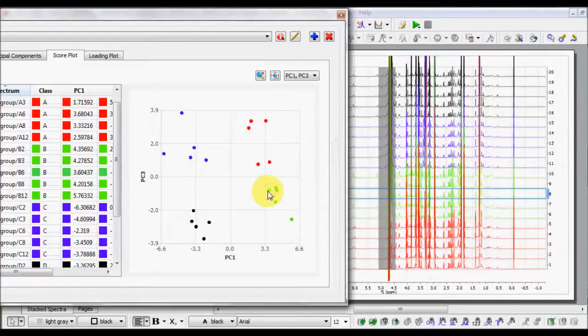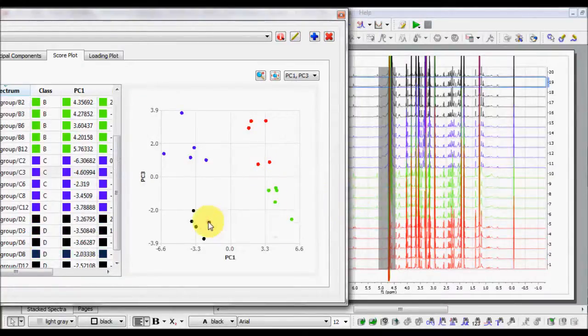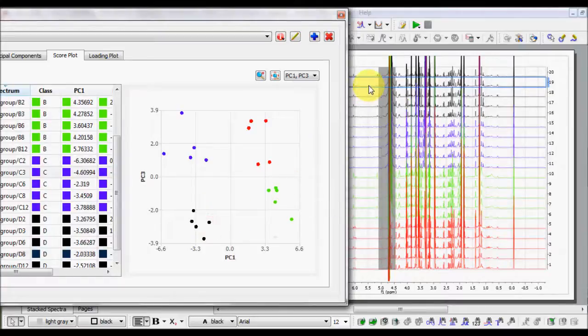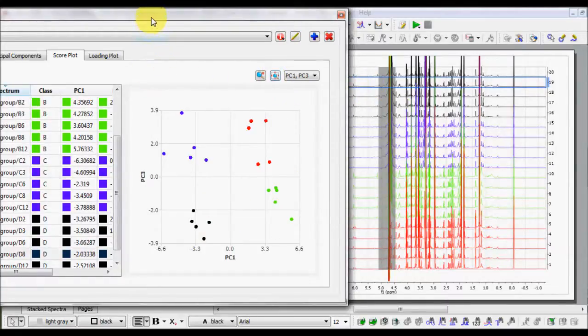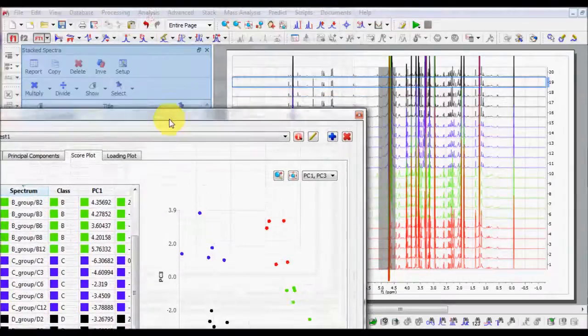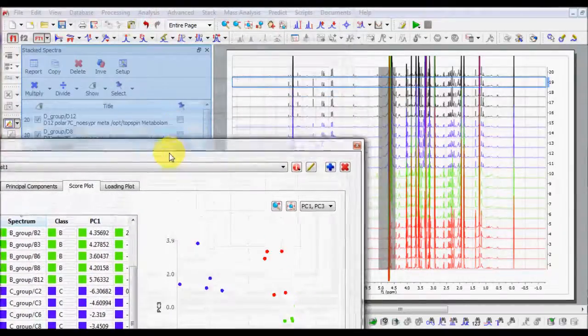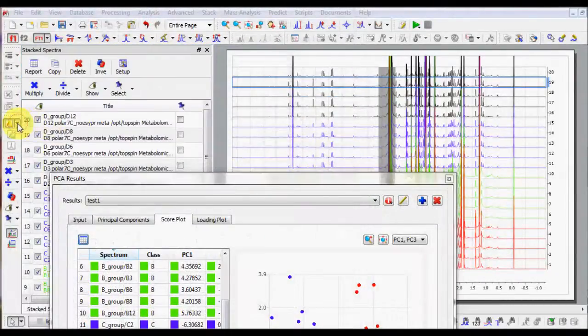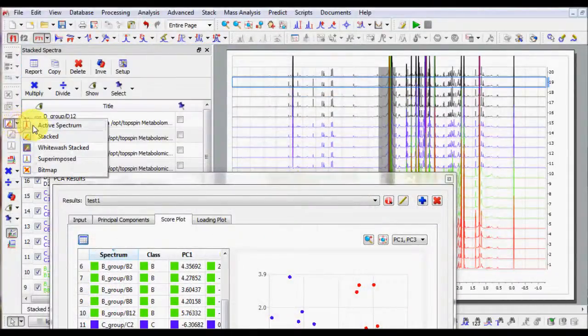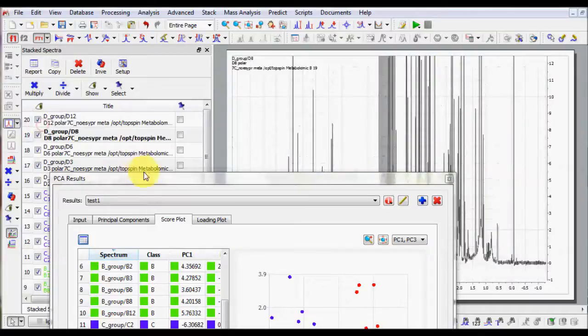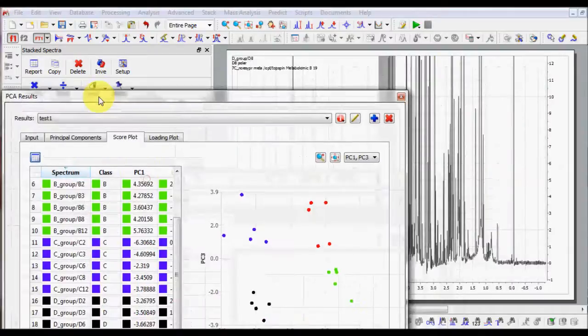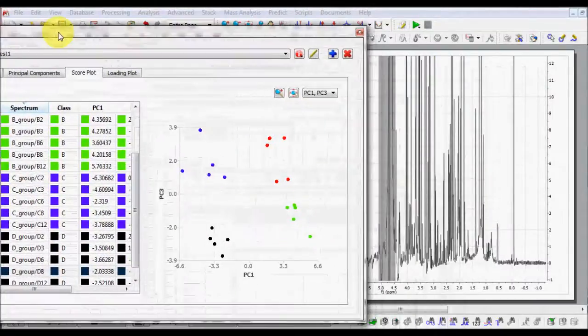If you select a point in the Score Plot, automatically Emenova selects the corresponding spectrum in the Stacked Plot. By changing the visualization mode of the Stacked Plot, you can easily follow the selection of the different points in the Score Plot.